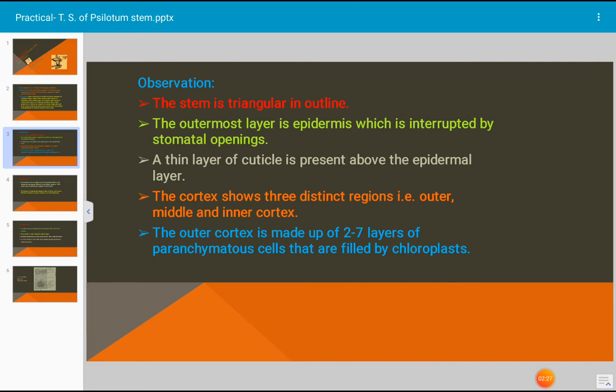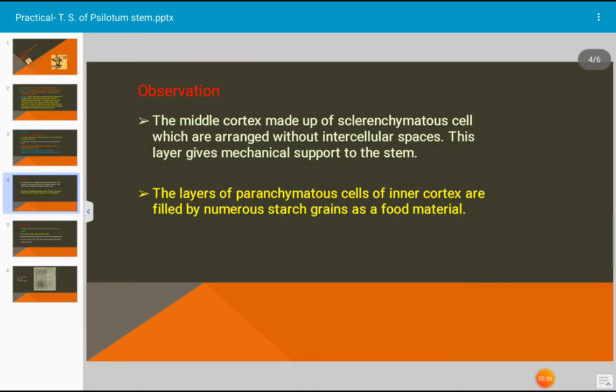The outer cortex is made up of 2 to 7 layers of parenchymatous cells that are filled by chloroplasts. The middle cortex is made up of sclerenchymatous cells that give mechanical support, and the sclerenchymatous cells are arranged without intercellular spaces.